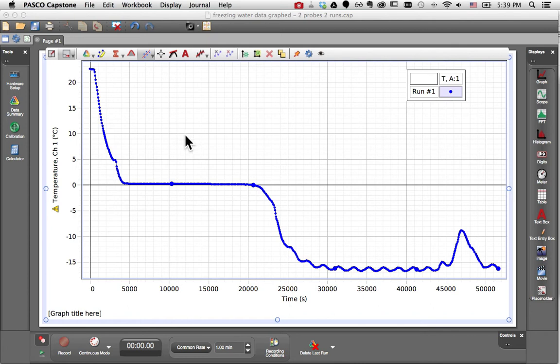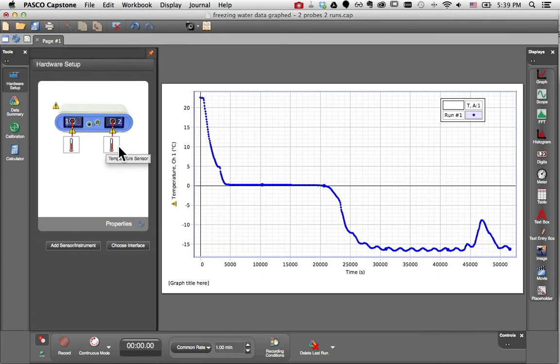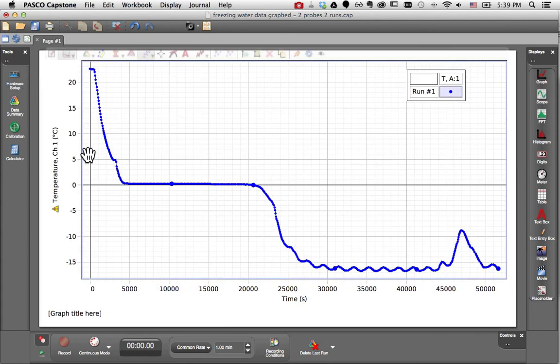I happened to place a second temperature probe in the same beaker in a slightly different location in the water, and I'd like to compare the two temperature versus time plots.